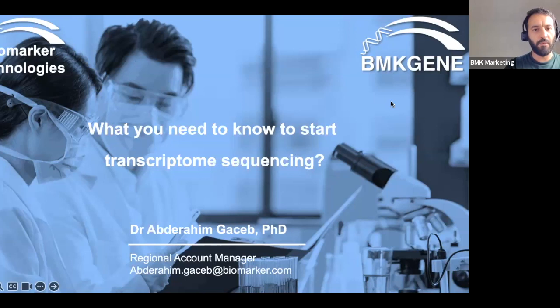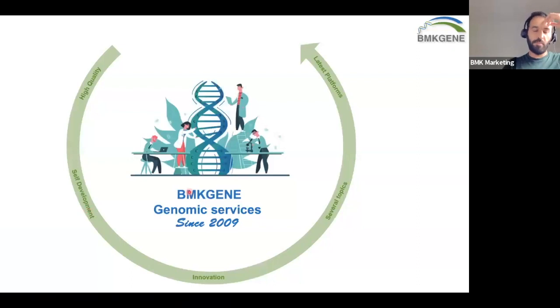So the aim of this webinar is just to discuss or to give a wide introduction regarding transcriptomics sequencing and what you need to know before starting your transcriptome sequencing. I just put the laser up. So I would start by just a quick introduction on the company that I'm working with.